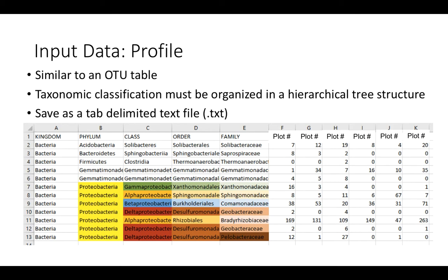In order to start your STAMP analysis, first you need a profile. This STAMP-ready profile is similar to an OTU table, but has been modified slightly to fit the requirements dictated by STAMP software. It's been previously mentioned that an OTU table must have its taxonomic classification organized in a hierarchical tree structure, but this is most important when looking at a STAMP-ready profile. The profile file example you see before you exhibits this proper structure that is necessary for STAMP software.